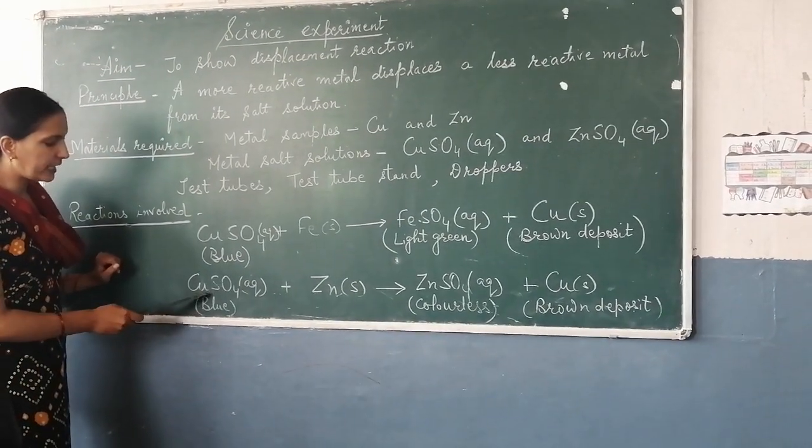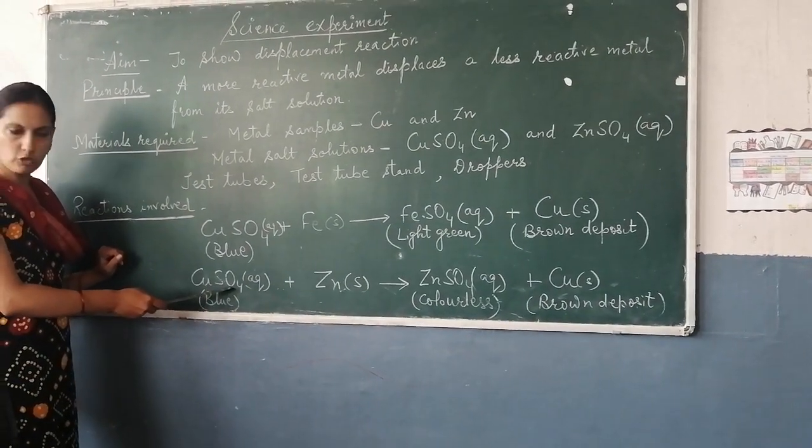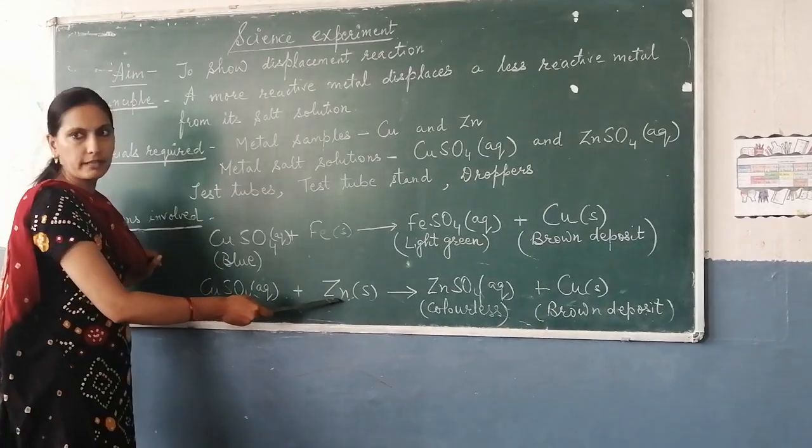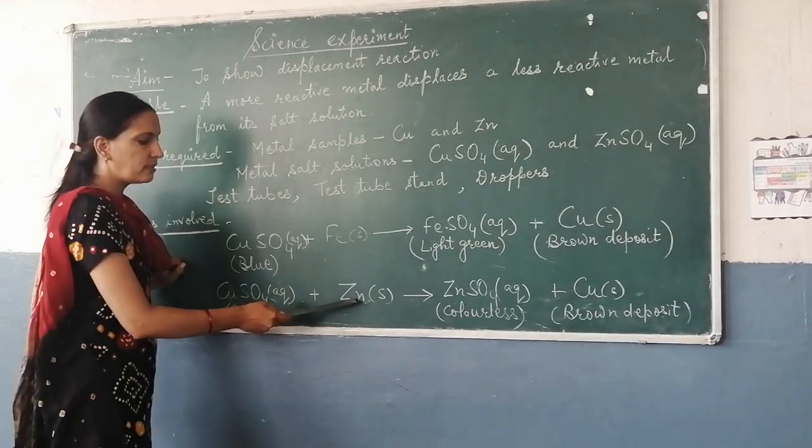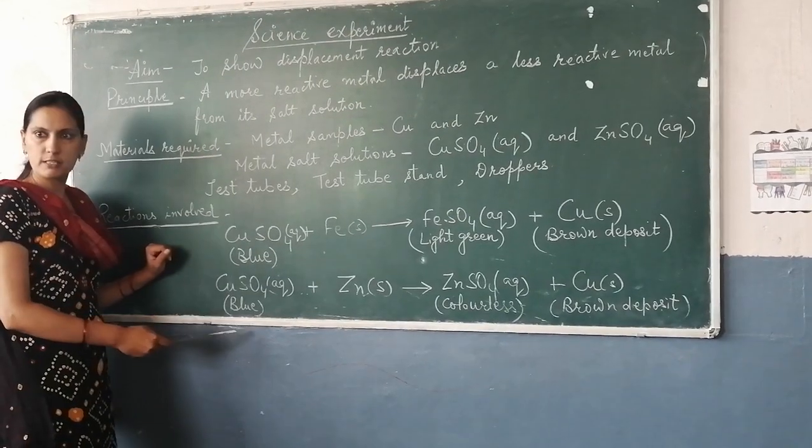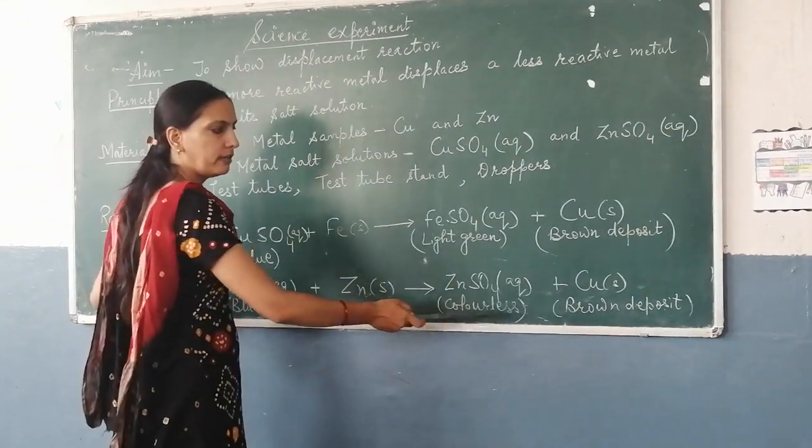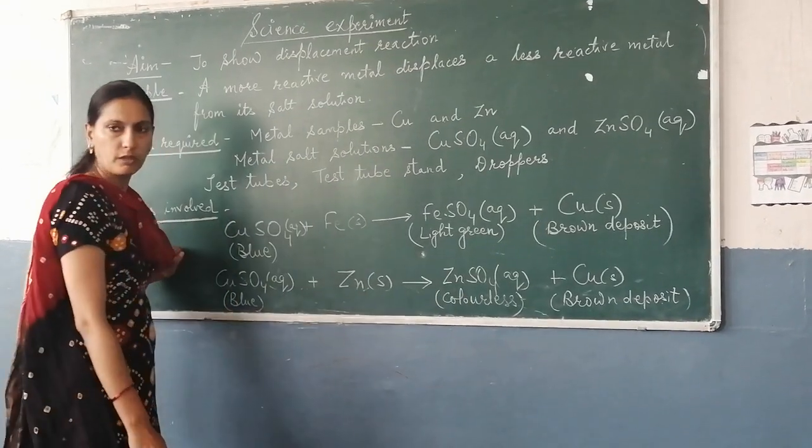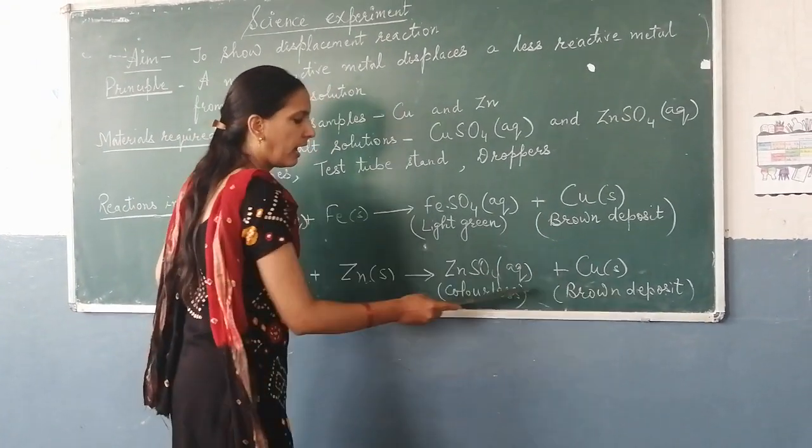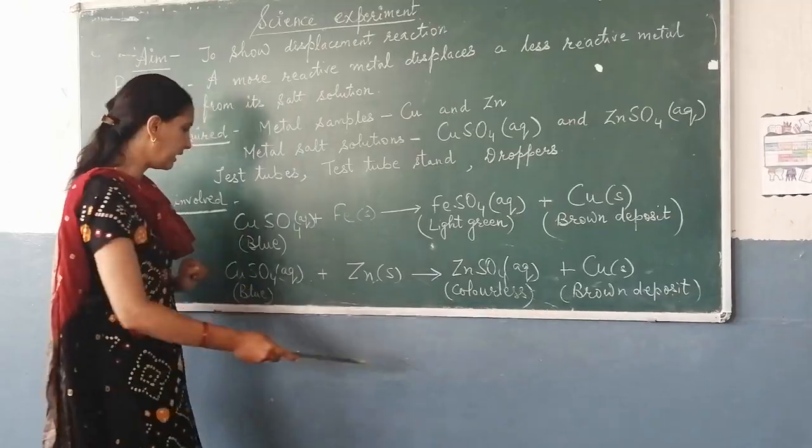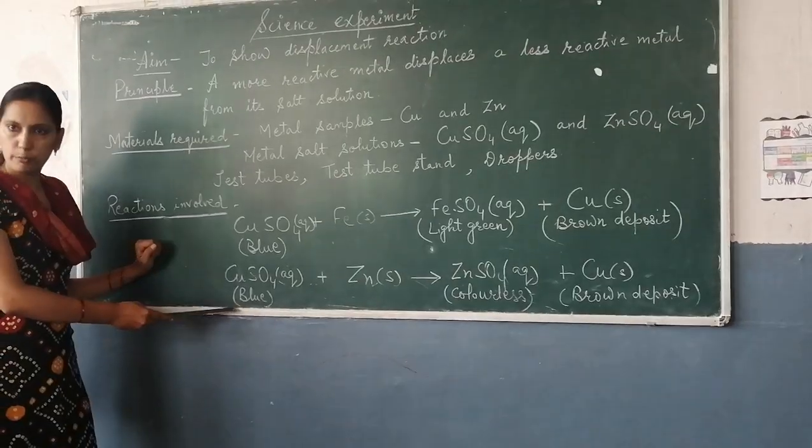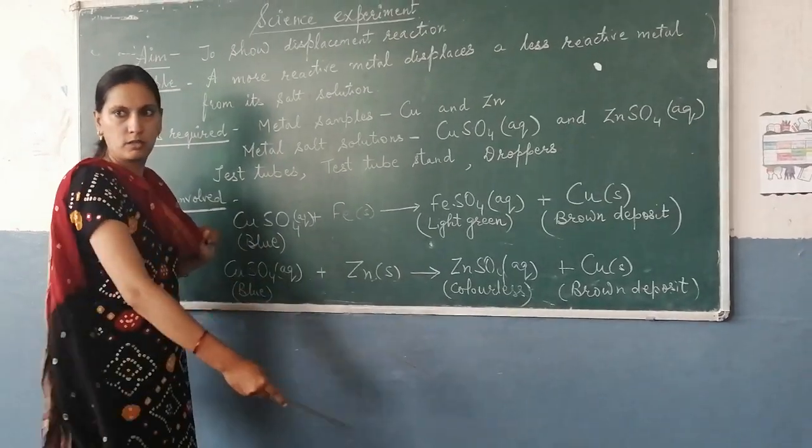Next, we will take CuSO4, copper sulfate solution, plus zinc granules. Zinc is more reactive than copper, so it will displace it from its solution and make zinc sulfate plus copper. We can see brown deposit, and zinc sulfate solution will be colorless from blue.